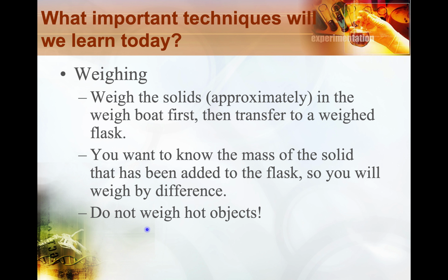And as a note, you're going to be heating up your flask to remove the methanol. You do not want to add a hot flask to the balance. We want to treat the balances with respect. So after you take a flask from the hot plate, let it cool down for a while before you add it to the balance.